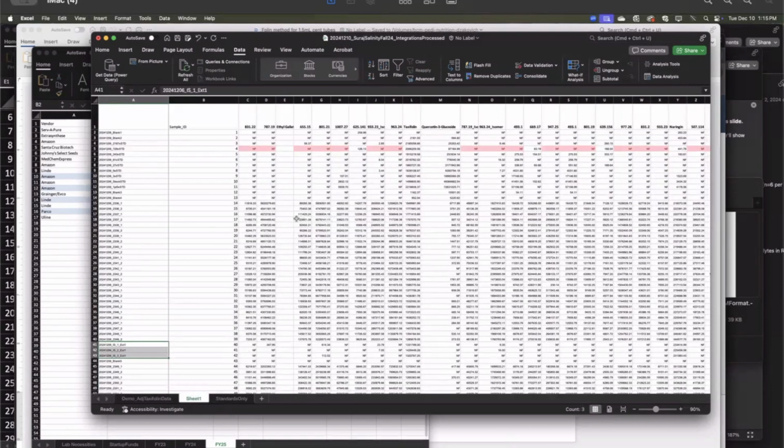So now we have to start correcting these peak areas for extraction efficiency. I'm going to come back in a little bit and we will get back into that.